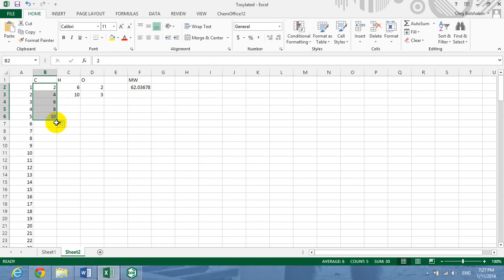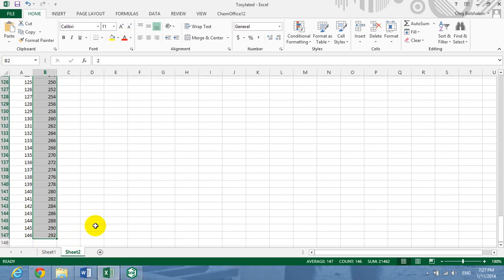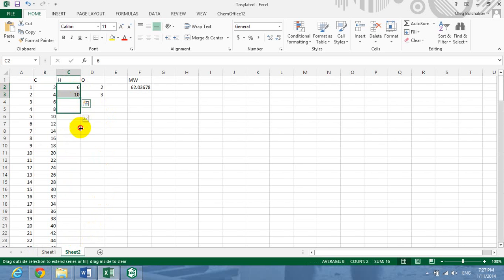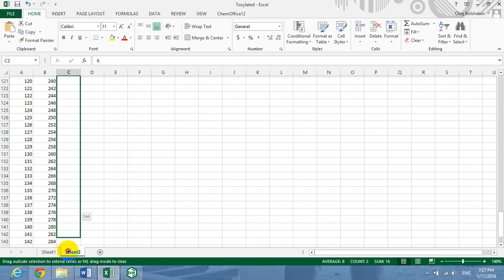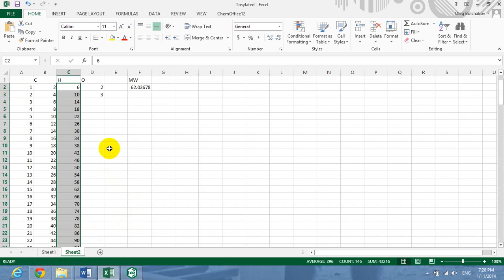If we select it and go further, it's going to happen gradually. The same thing is going to happen to the hydrogens, it is +4, so any other ethylene oxide unit will make the molecule 4 hydrogens heavier, and you can easily check it.